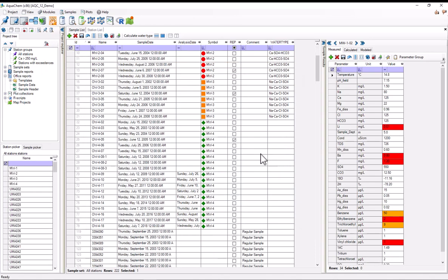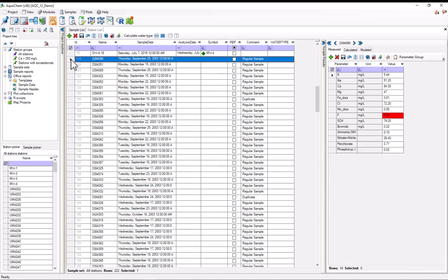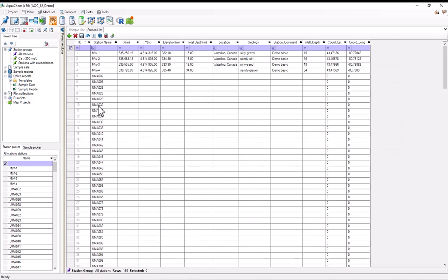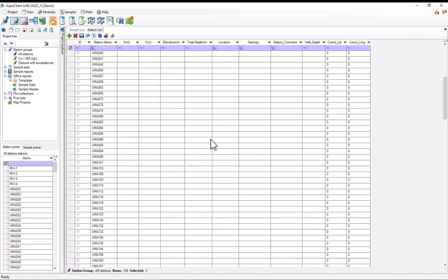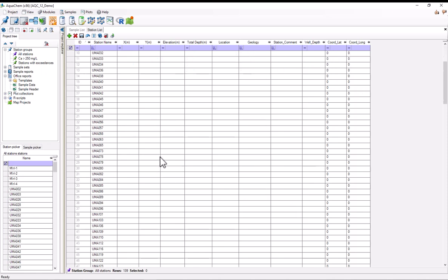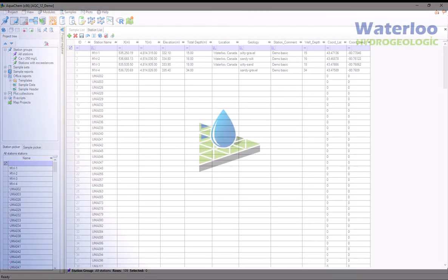So we can see on the sample list, it's automatically refreshed. And we have all of our different samples. Additionally, we can see on the station list, AquaChem has added quite a few stations. Obviously, the only data that it had available for it was just the names. So I would somehow need to update all the other data for this. But anyways, that's everything that I wanted to show in this demo. Thanks, and I hope you learned something.